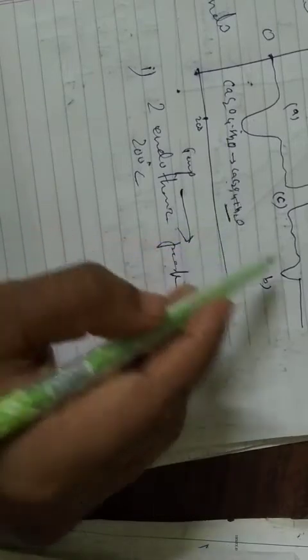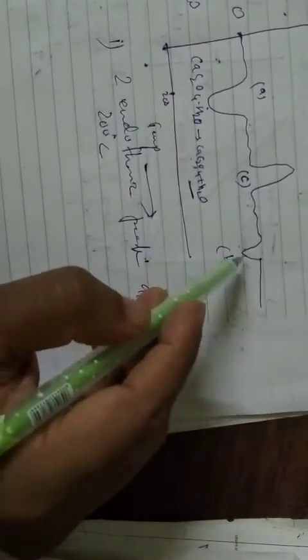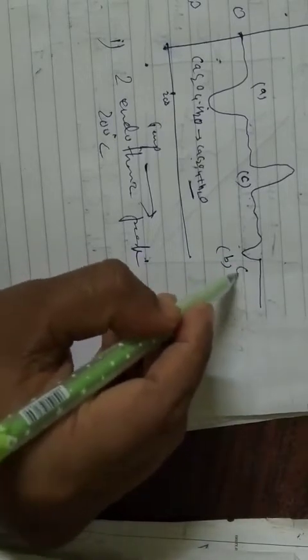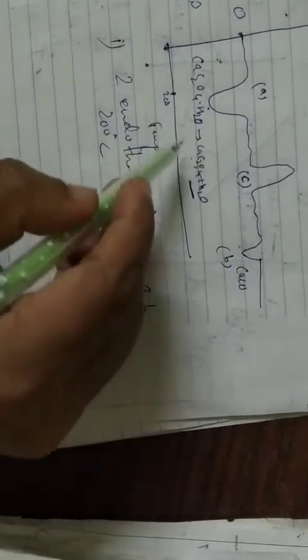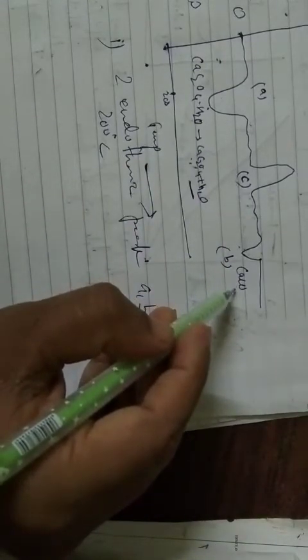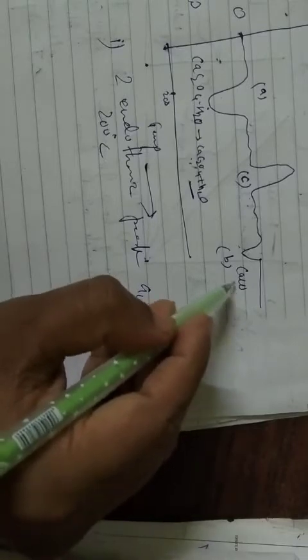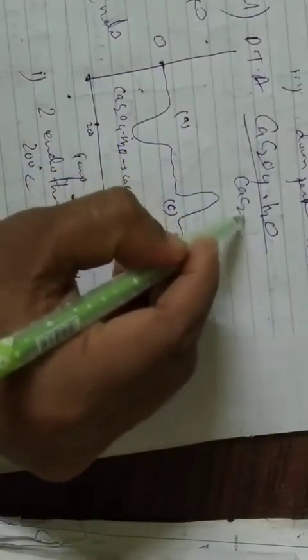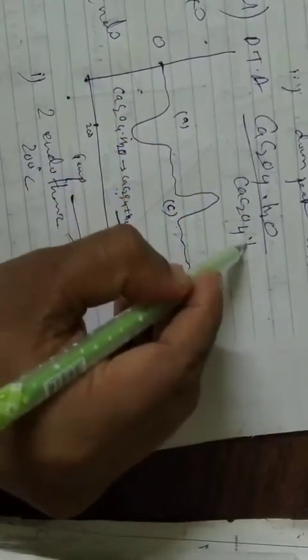Now in B, what is observed is that calcium carbonate converts to calcium oxide. Before this, definitely we'll take the reaction of calcium oxalate monohydrate.